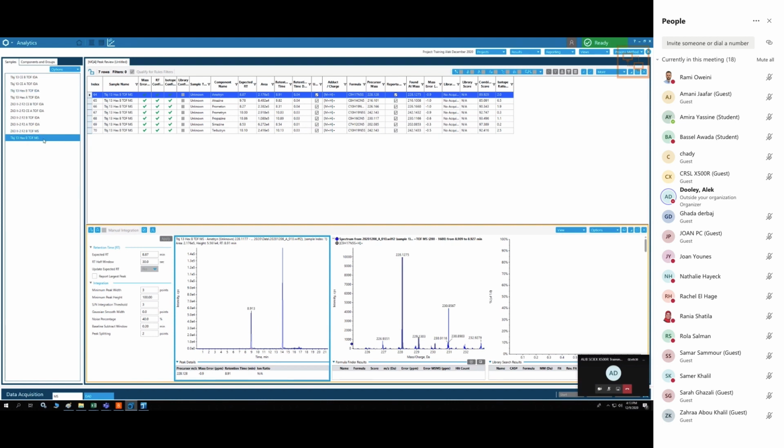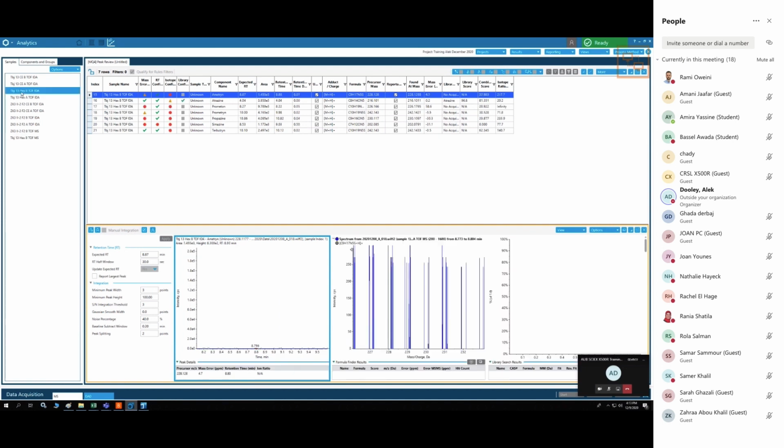I have to look carefully at the chromatography system. Something is a little bit strange here because our retention times are all over the place. TBJ 13 hex B, TBJ 13 hex B. Yeah, so look at that same sample, very different. So that means it's not the samples. It has to be something with the chromatography.